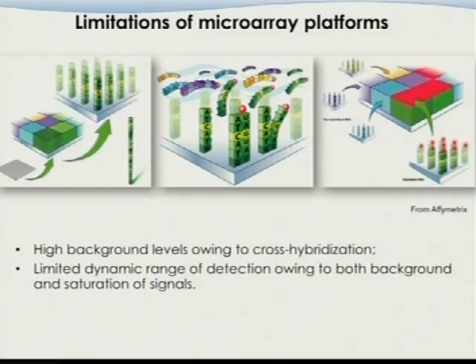That is a gene that is expressed a lot in most tissues. Once you see that it comes here and this is really, really bright, but in another condition it doubles the expression level, what you will still see here is that big red dot, because the signal has already been saturated.